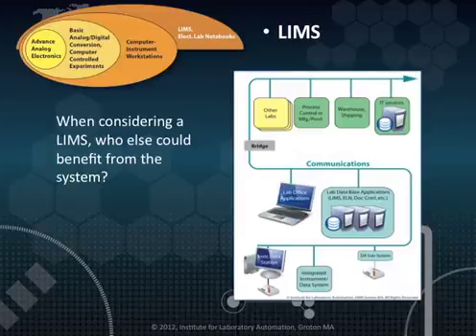When you try to justify the purchase of a LIMS, look outside the laboratory. The work in a testing laboratory is done in support of other groups. Could the purchase of such a system, with faster reporting, and the potential for users to look at the system to find out the status of work, be of benefit to them? There is an opportunity to improve not only the laboratory's operations, but other organizations as well.